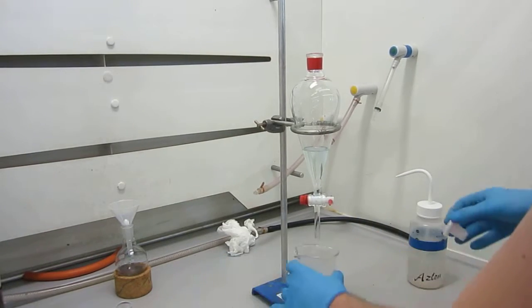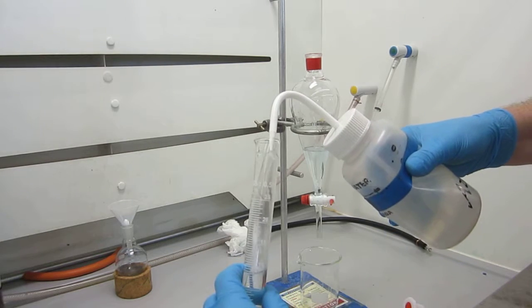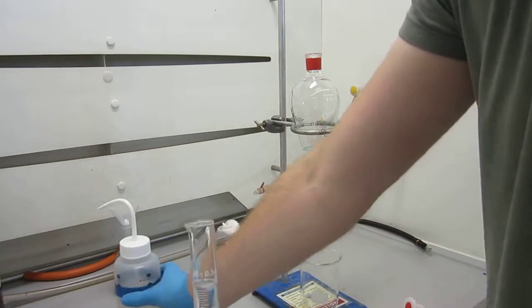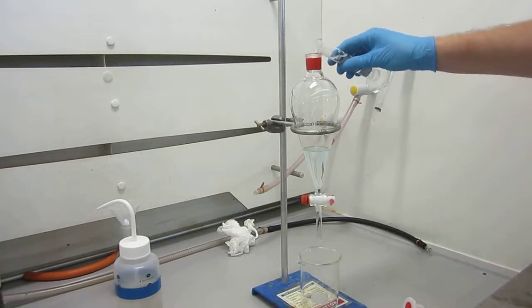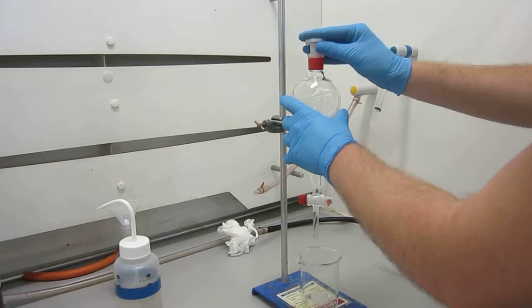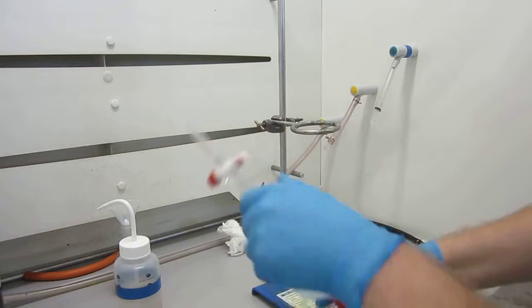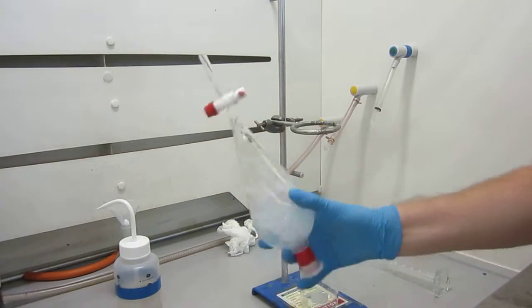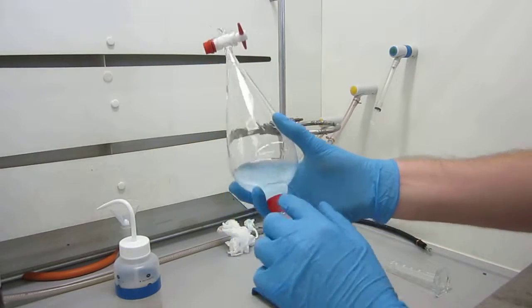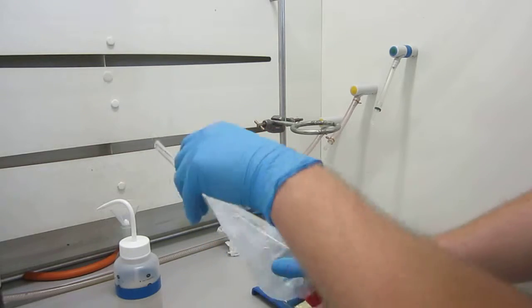So, waste underneath. Final 25 ml of extracting solvent, so this is the water. It's common that you'll be extracting with an organic solvent from an aqueous reaction mixture as well, so it works both ways. Chuck that in. Bung in and shake. And remember to vent. Don't have it closed, start talking to someone and not vent it, because the likelihood is that it will push the bung out on your finger and it will all come down your arm. And it does happen.